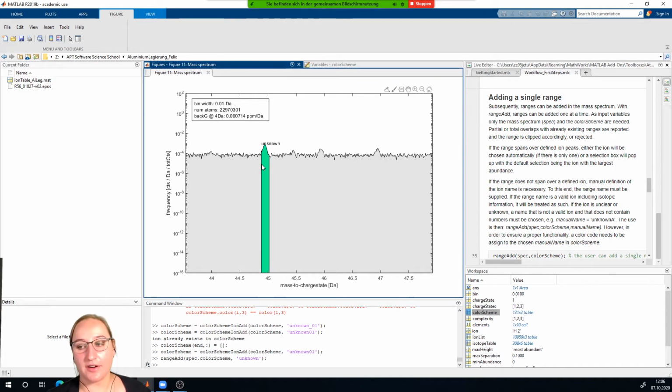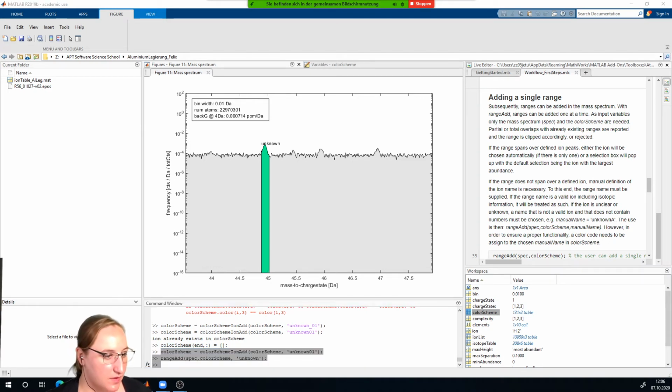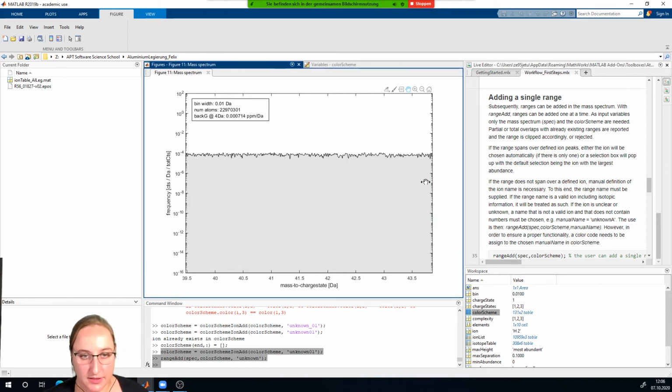And now we have our peak called unknown. I will give you both of them maybe in the same. Okay, so in this case you can continue.